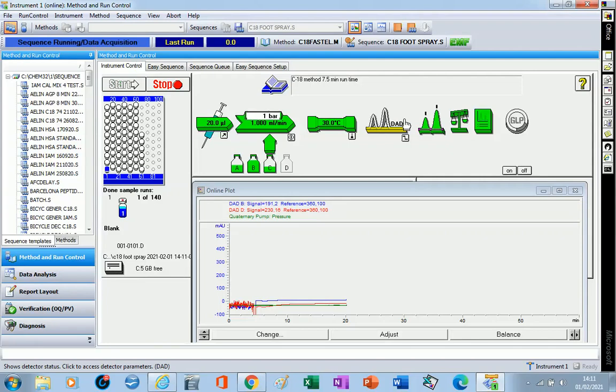It also checks the diode array detector, which is yellow, which means it is zeroing out and checking that everything is okay. And when it gets green, now you can hear my HPLC started the injection. So this is a short video on how to start a run and what the most important files are, the method and the sequence.